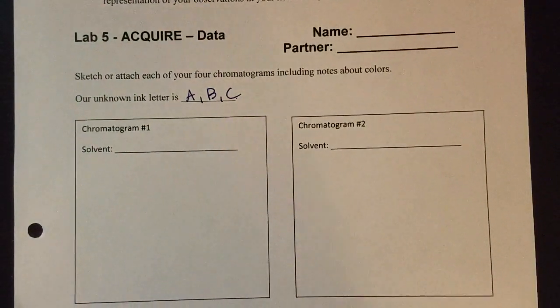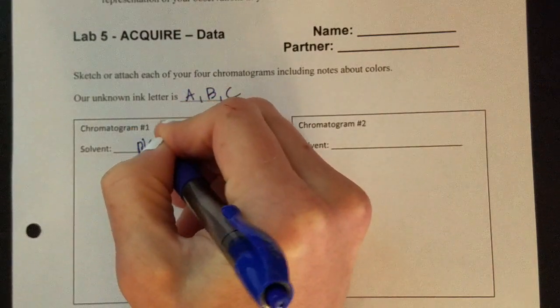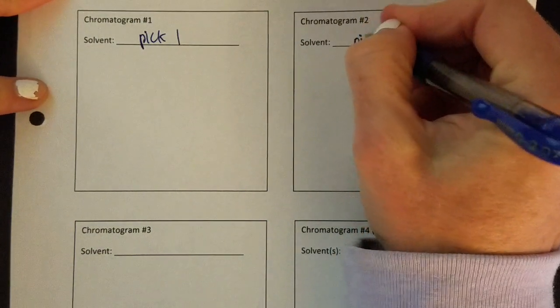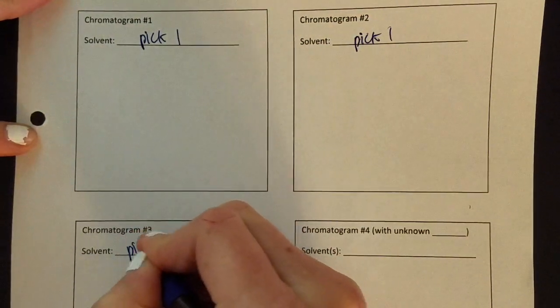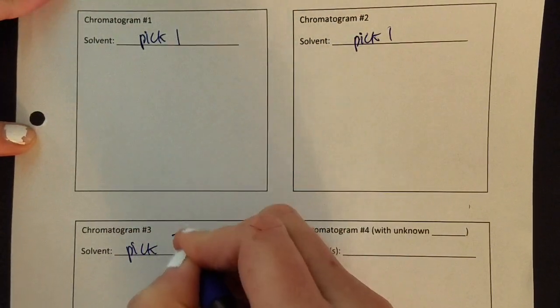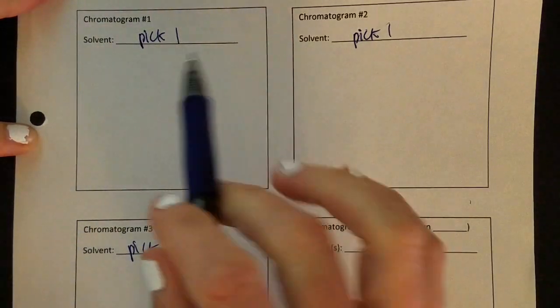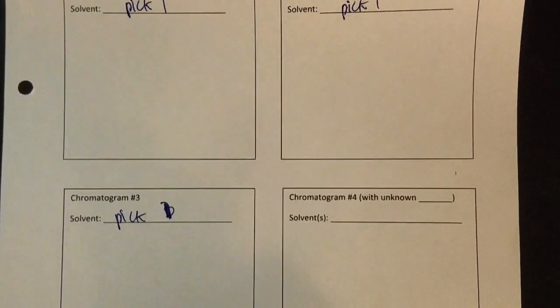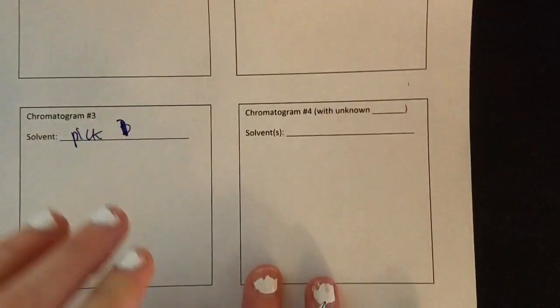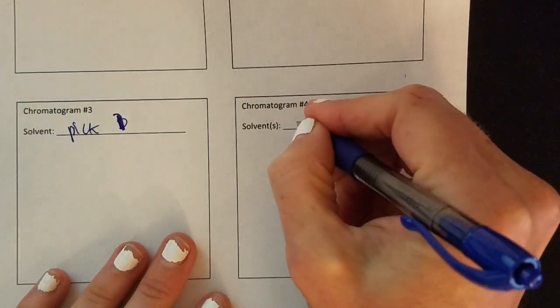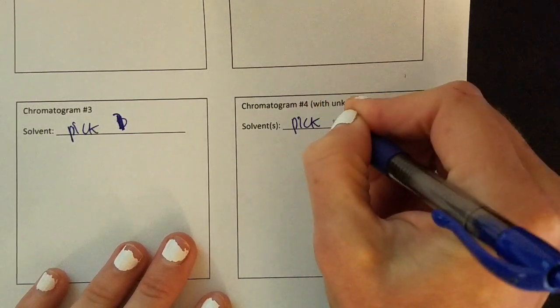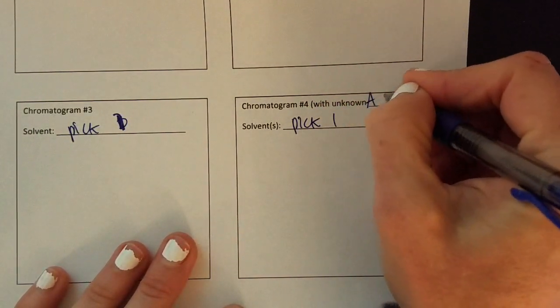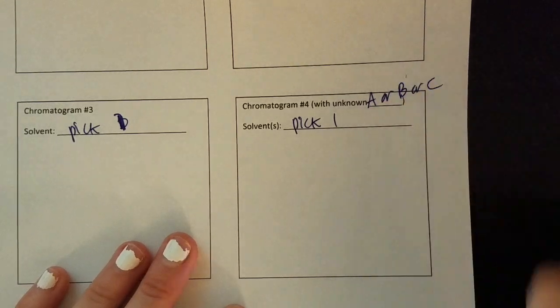For these, just pick one solvent here. Maybe one that's interesting. Pick a second solvent here. Pick a third solvent here. Not three, but one. So out of the six solvents, you'll draw three. That'll be in steps one through four. And then chromatogram four for the unknown, you will have three of them. But just pick one of the unknowns. So show A or B or C.